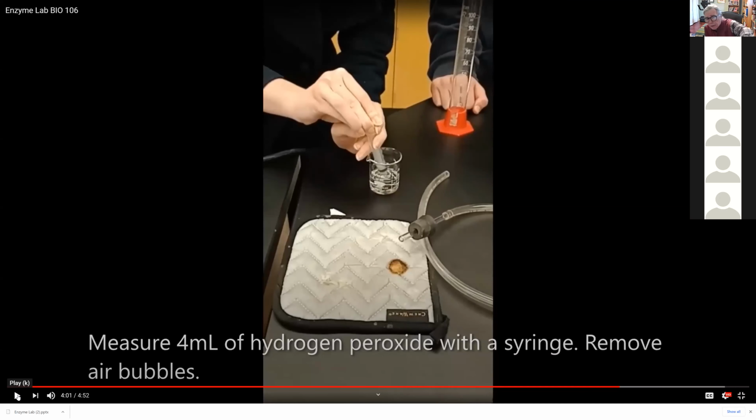Okay, here, if you see this thing right here, this is a plug that's going to be put in the top of the reaction vessel, and in that cork is a glass tube connected to a rubber tube, and it has the top of a syringe. Now they twisted off the syringe and are filling it with 4 milliliters of hydrogen peroxide, the substrate.